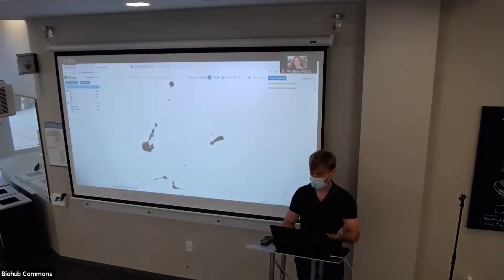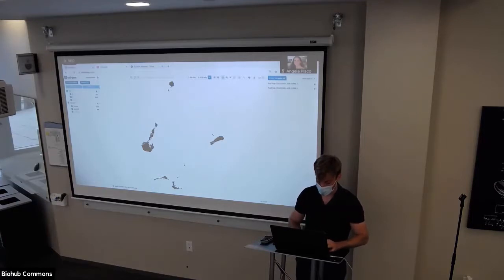So let's say I have a big data set, right? This is a small one, but let's pretend it's a big one. And then I want to do some complex selection. Maybe this complex selection is hard to get using the categoricals on the left, because that's easy, you just uncheck and check. And then I'll hit cell set 1, and the other cells are in a configuration that makes it really hard to select all of it. So what you can do is use this hotkey, Shift I.